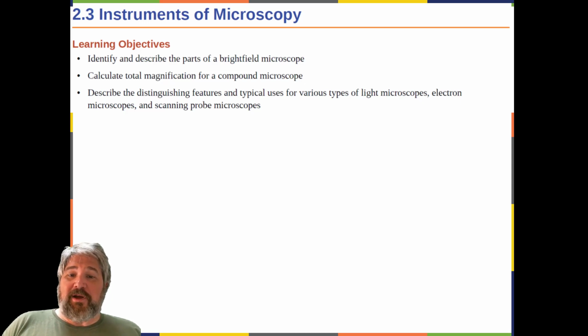The early pioneers of microscopy opened a window into the invisible world of microorganisms, but microscopy continued to advance in the centuries that followed. In 1830, Joseph Jackson Lister created an essentially modern light microscope. The 20th century saw the development of microscopes that leveraged non-visible light, such as fluorescence microscopy, which used an ultraviolet light source, and electron microscopy, which uses short wavelength electron beams.